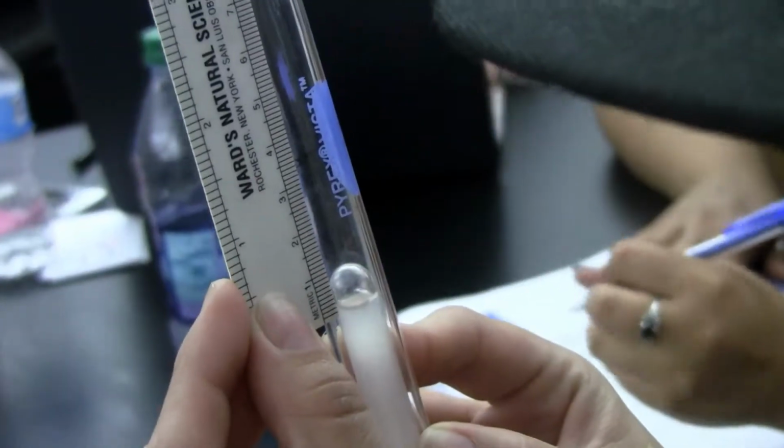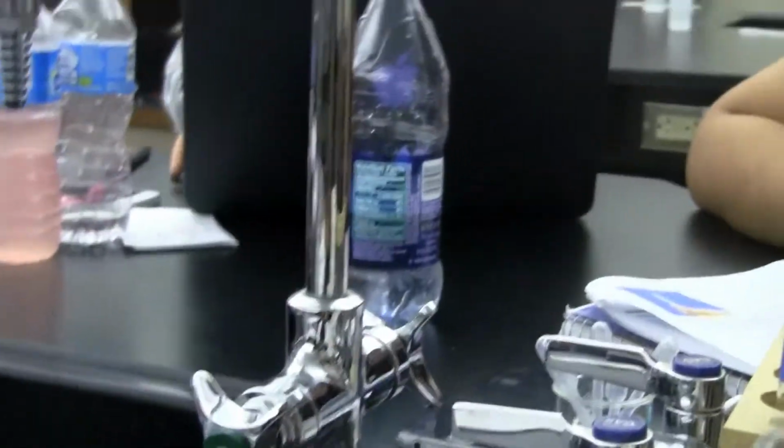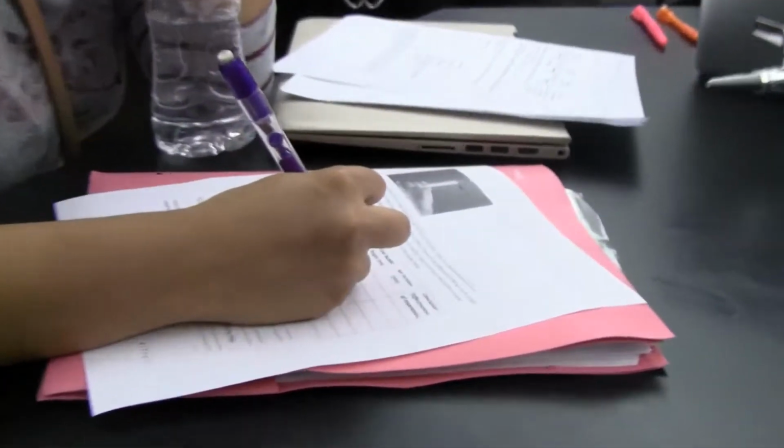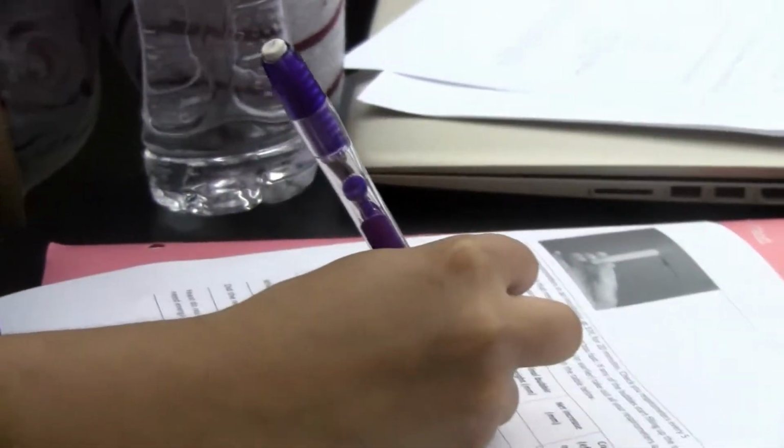So 1, 2, 3, 4, 5, 6, 7, 8. 8. Okay. That one didn't grow as much, so that's a good thing. So glucose, we're looking good. Our hypothesis is looking good. What numbers do you have? It's 7 and 8 so far. Write those numbers down.